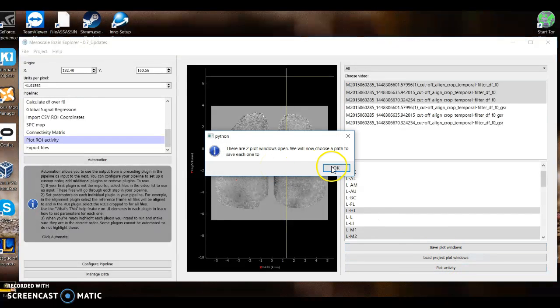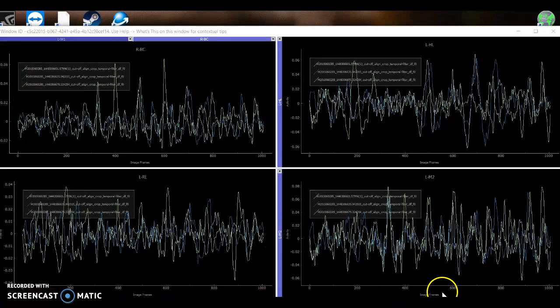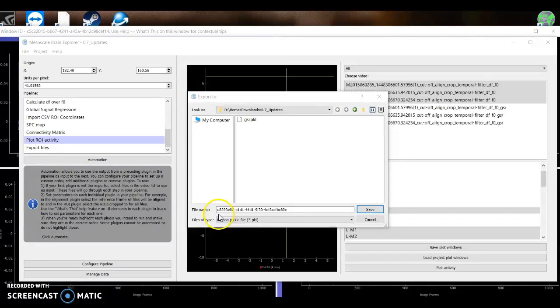So there are 2 available. So we have to make sure what the ID is. This is okay. So D8. This should be GSR. Yeah, that's fine. Already have that one. C5. This is just delta F over F naught. I'm gonna make that underscore.